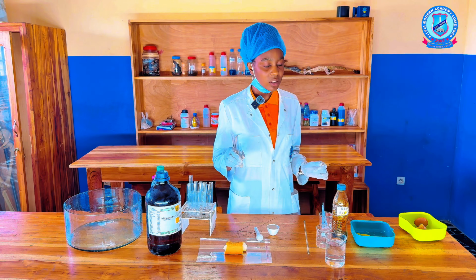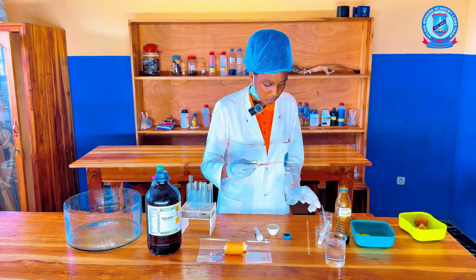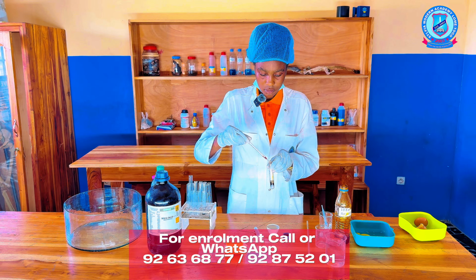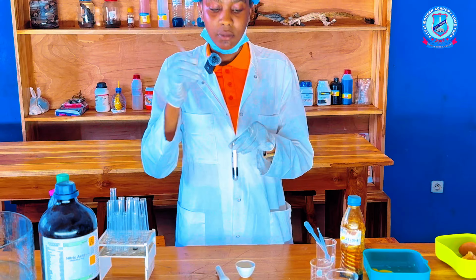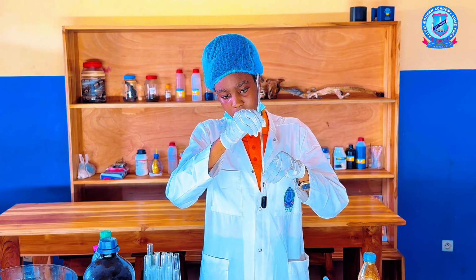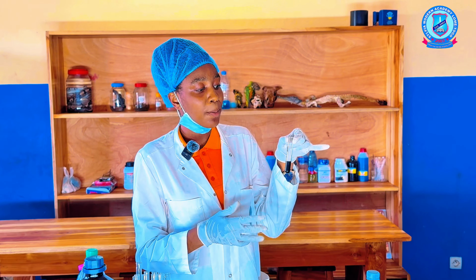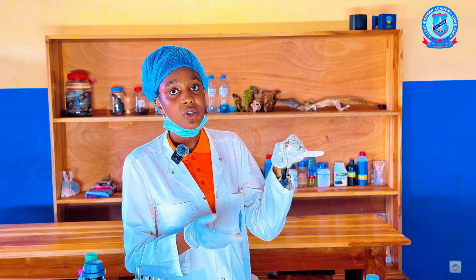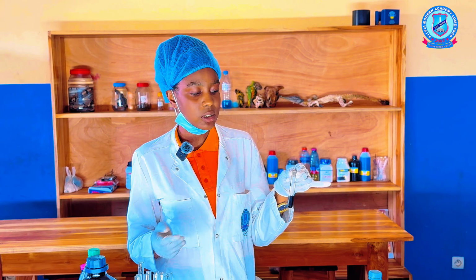After it is done, we're going to add a few drops of iodine solution to our test tube. We're going to stir the mixture. You can see that something has happened inside the test tube, and there's a color change due to the presence of starch.